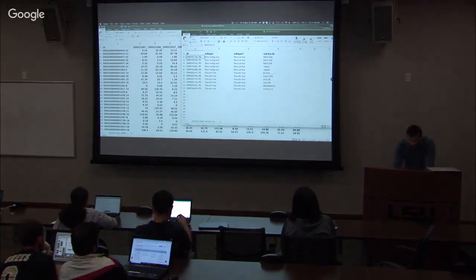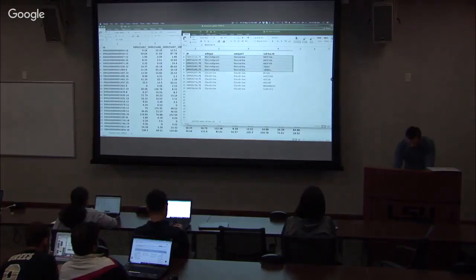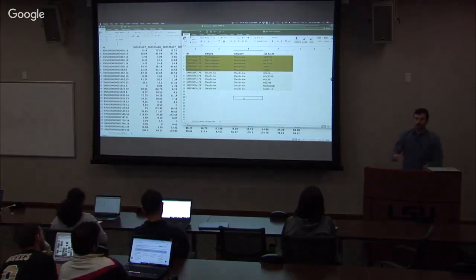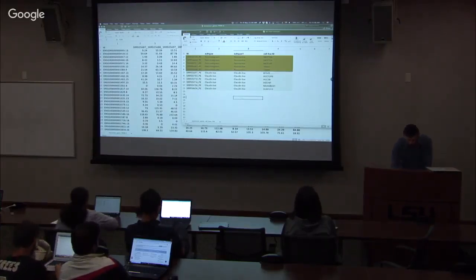So what we can do is color this with yellow, and let's color this with, let's say, green. We want to compare in differential gene expression how normal-like is different from claudin-low. So let's start from the beginning: 687, 688 are normal-like. 697 is claudin-low.